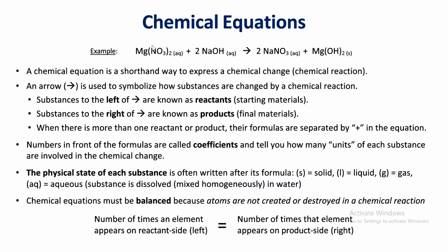By the way, this reaction that we're looking at is similar to the reaction we're seeing today, which shows us that when you mix two aqueous solutions, you're going to form a solid. This is a precipitation reaction, when you mix two liquids and you get a solid.